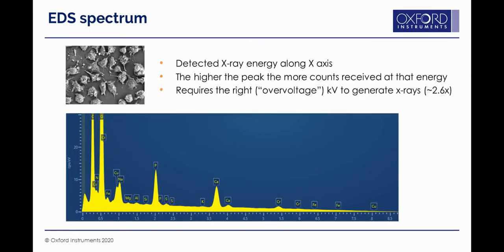Here is a closer look at a spectrum generated from the sample shown in the electron image — macrophages grown on a plastic coverslip. Along the bottom we have our X-ray energy, and where we have peaks, that's where we've accumulated many X-ray counts at that energy. The peaks indicate X-ray intensity, and this allows us to generate quantitative data about how much of each element is within our sample.